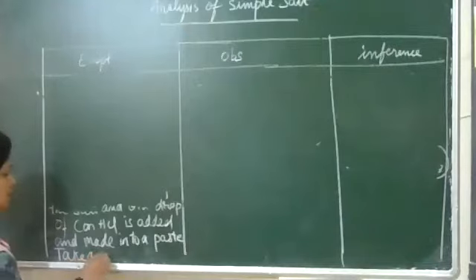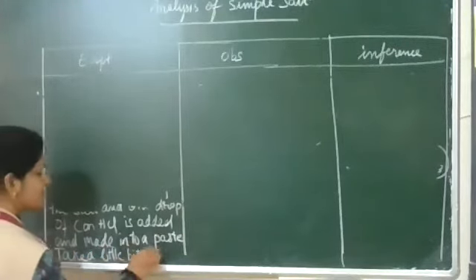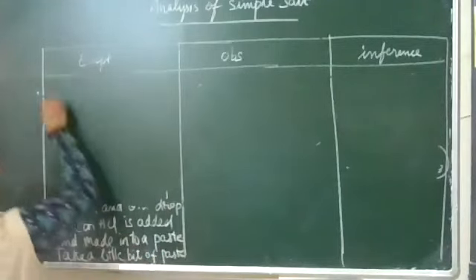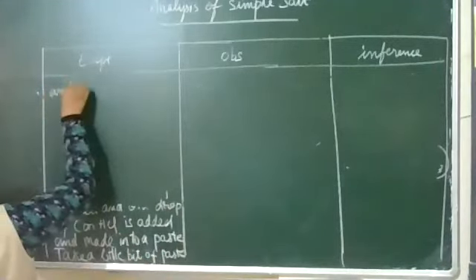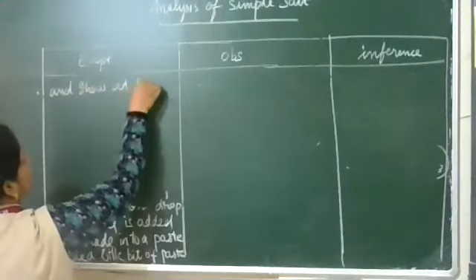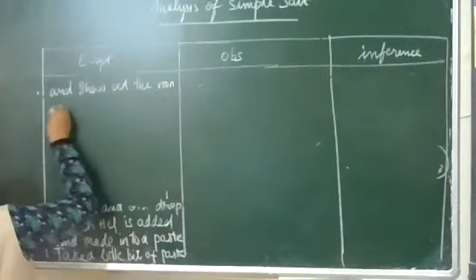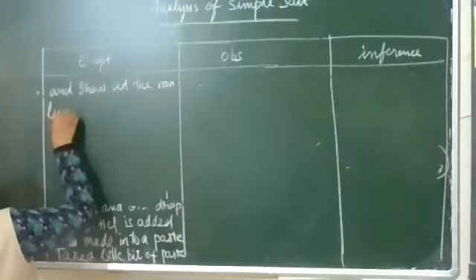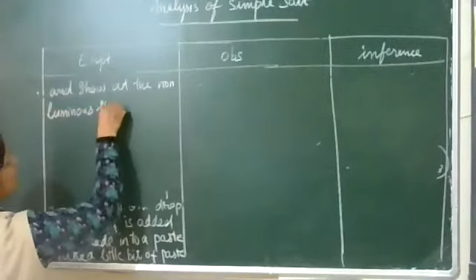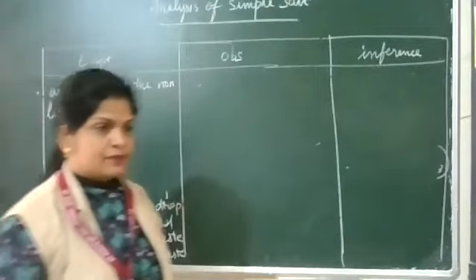Take a little of the paste and show it at the non-luminous part of the flame. The non-luminous flame is the blue flame.